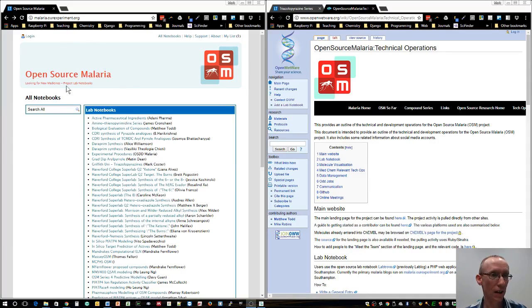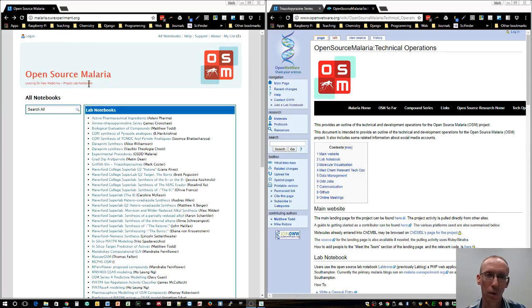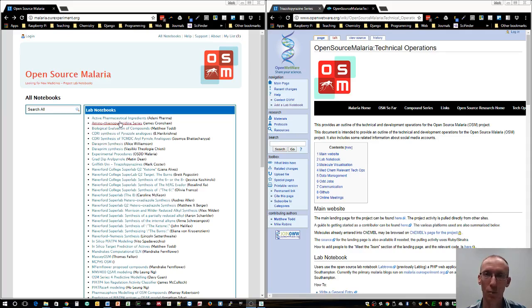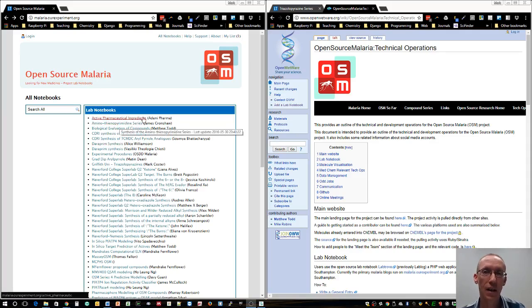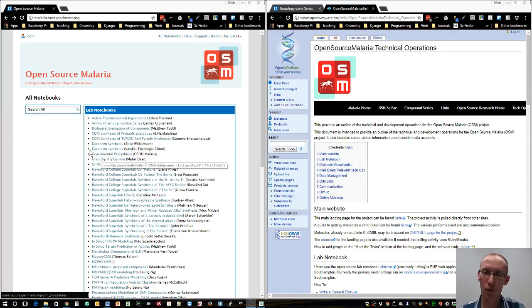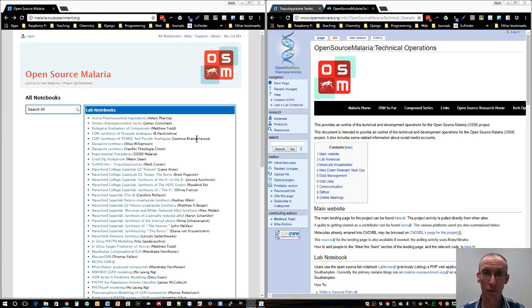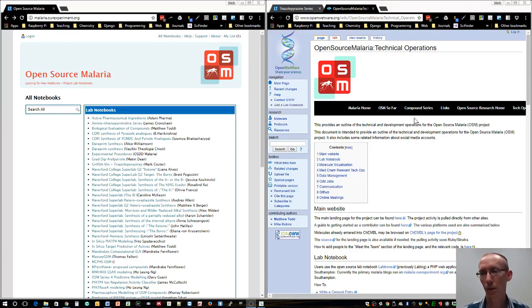There's also the open source malaria blog style site which includes all the lab notebook entries, and then there's the github. We won't be looking at that today, but I'm going to focus on how to get this lab notebook set up.